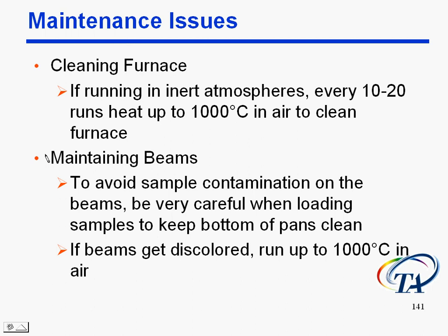Now, to maintain the beams, it's very important that when you load samples, you don't do it while the pan is sitting on the beam, because if you spill any, it could get stuck around the edge of the pan where the pan sticks to the beam. You could actually have a sample that welds the sample pan to the beam, and you would have to go through and replace the beams. Not a good thing. If the beams get discolored, run up to about 1,000 degrees in air, like we talked about for cleaning the furnace, and that would typically clean the beams off.